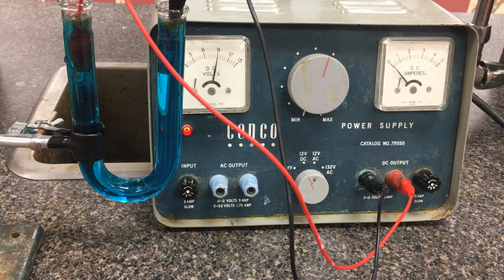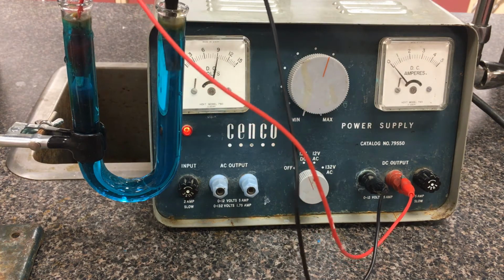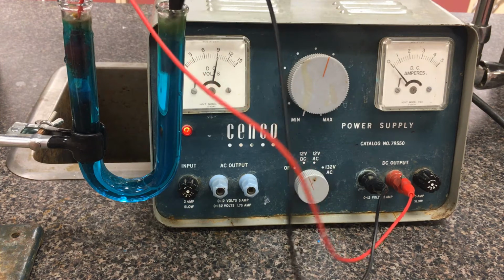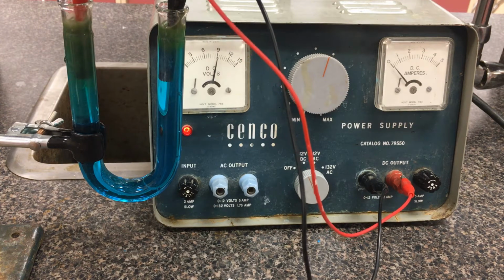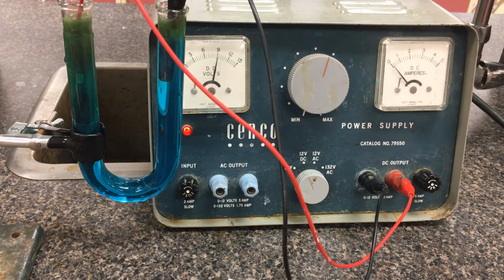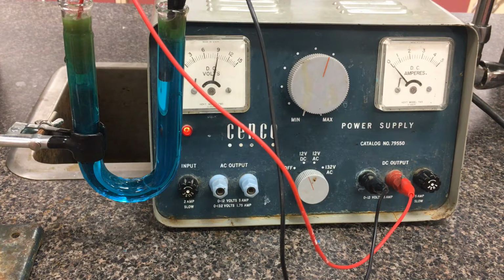Give it a little while for the reactions to occur. Get this one a little shake so you can see a little bit better. And similarly for this one, a little bit of a shake. By making some physical observations, see if you can identify what chemicals have been produced. I'm going to just let this run for a little while. The voltage is basically forcing the reaction to occur. The longer that I wait, the degree of completion will be higher.